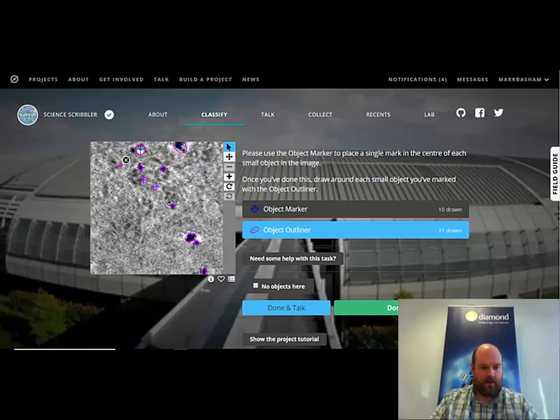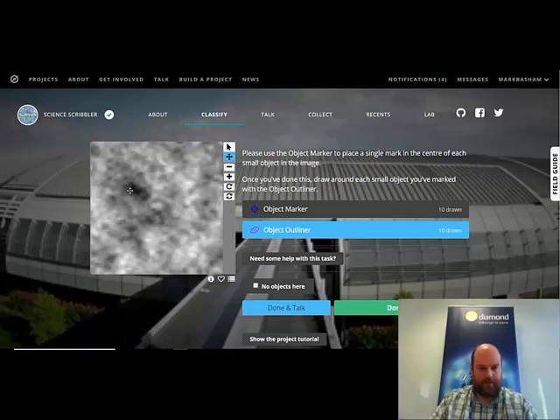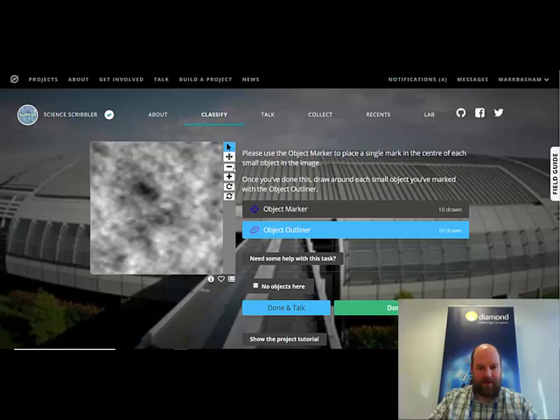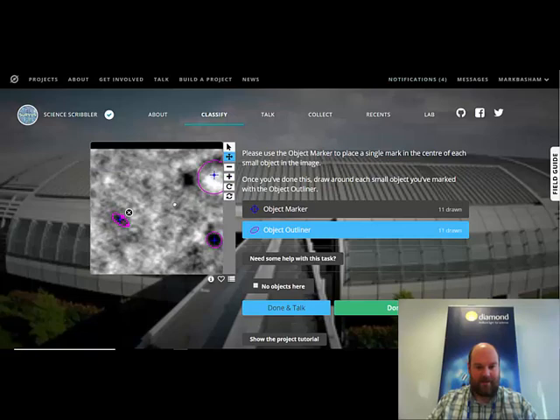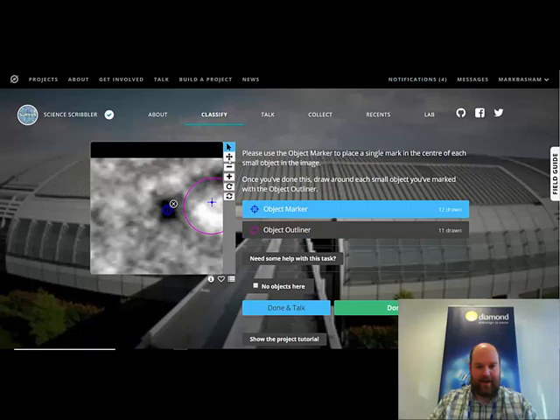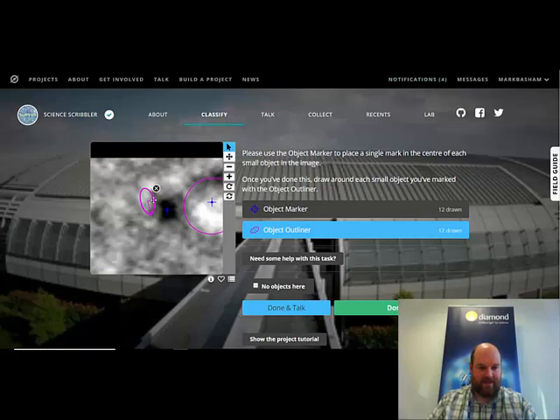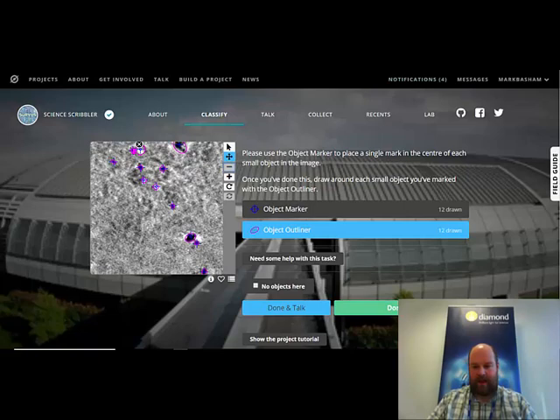In fact, that's probably one over there. So I'm going to zoom in over here. Yeah, I'll pick that one as well. Now, I'm not a biologist. I'm a physicist and a software developer. So I have no idea of really the biological information that's going on here. But the thing that's interesting with this is that all we really need to do is pick these items. And that gives, when we do the analysis, that enables the biologists to pick the information that they're interested out. So as long as we highlight anything that looks roughly like we're interested in, then we're fine. And in fact, there's clearly another blob there. So this is a nice thing. You can just quickly nip back and fix up anything that you want to if you realize you've missed a spot which you think might be quite important. Good. So once again, we're going to zoom right out. Get back to the main picture. That looks good. And we can say done.